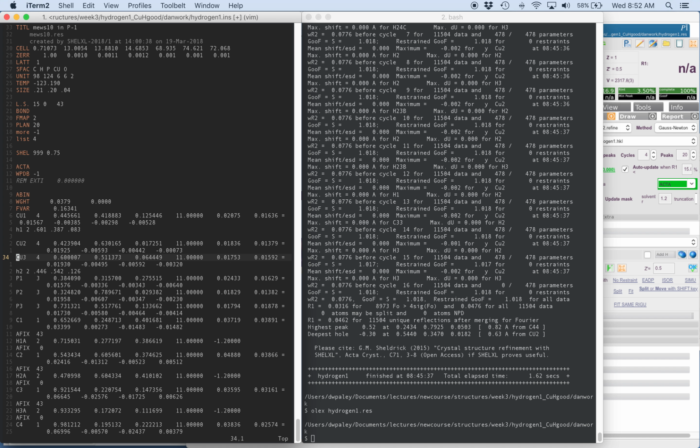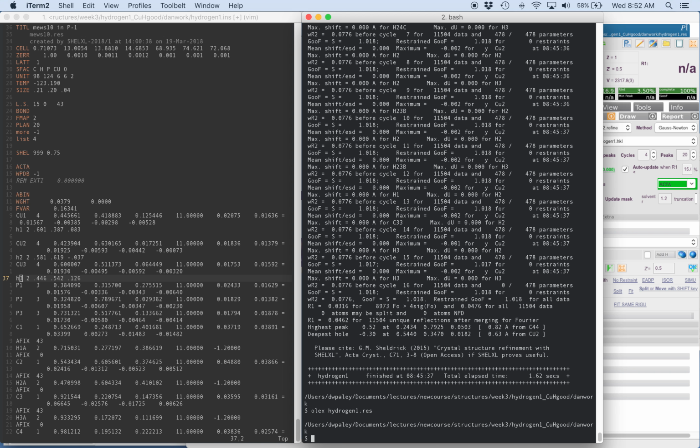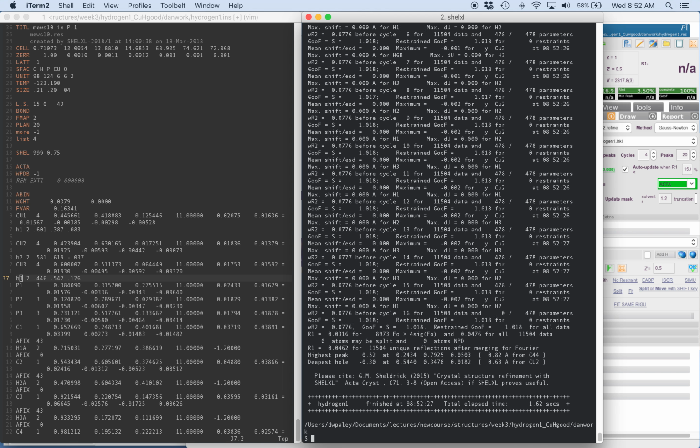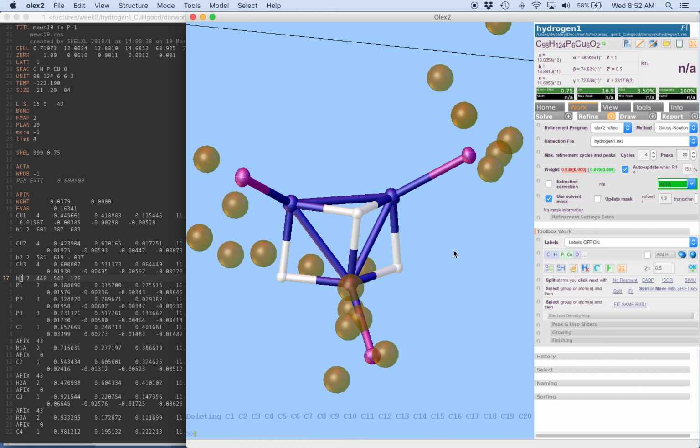So we're going to take hydrogen 1, put it under copper 2, and rename it as hydrogen 2. And then copper 3 is left with hydrogen 2. We're going to rename it as hydrogen 3. We'll rerun this refinement quickly just so that the names are updated and we don't get messed up. I'm going to kill the carbon atoms again. Okay.